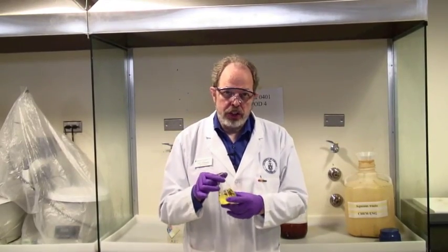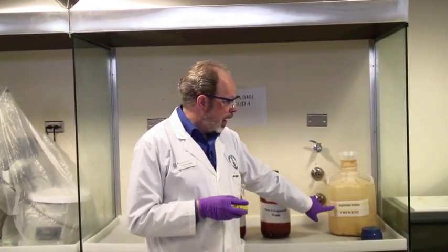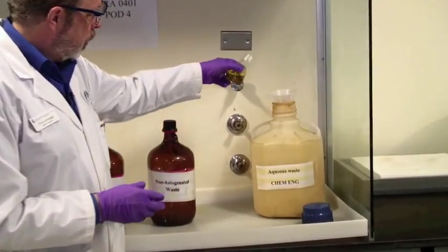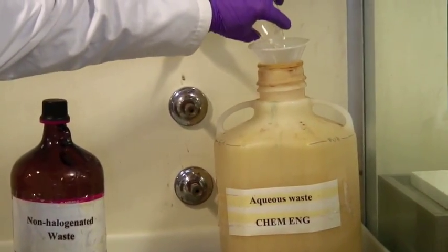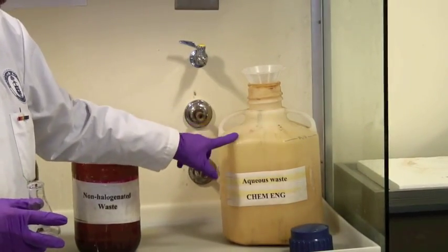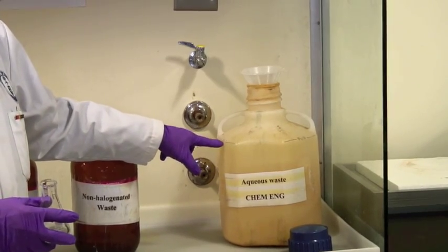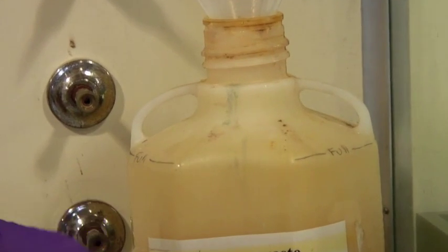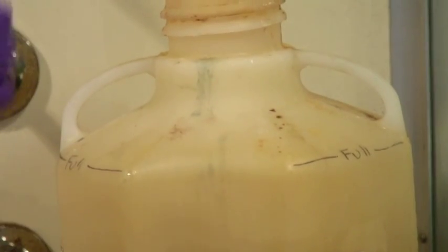Waste from a titration needs to go into the aqueous waste bin. There'll be a funnel on top. When you're done, just pour it in. That's all you need to do. Notice that there is a full line on the waste bottle. If the liquid gets above this line, do not put any more in. Speak to a staff member. We will get you a fresh waste bottle, but do not overfill the waste bottle.